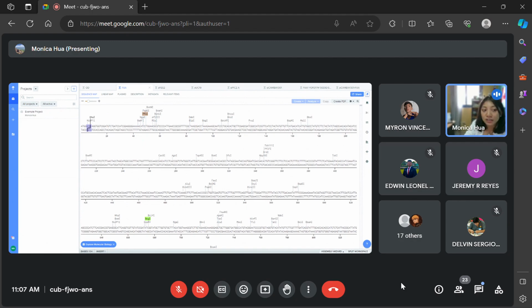It will recognize those four, for my one, 4 base pair sequence for HHA1. So you have to copy the whole thing that's been highlighted. Everything.